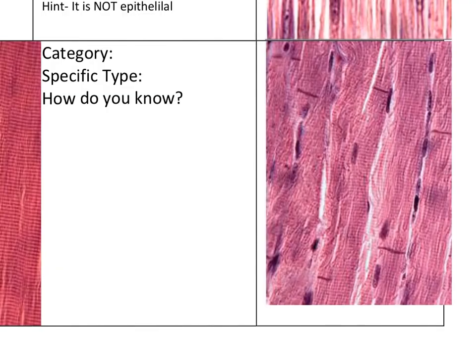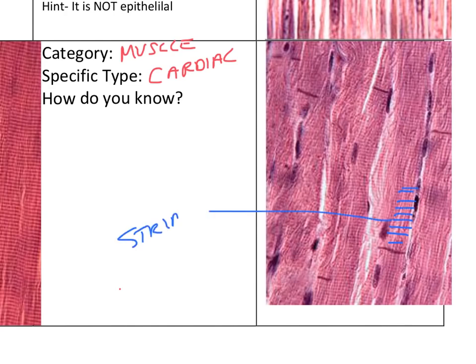And this is one other type of muscle. You're probably taking a stab at this being cardiac muscle on account of the fact that it's the only one we haven't looked at yet, and that would be true. Cardiac. The giveaway is the fact that we have striations. It's striated like skeletal muscle is striated, so is cardiac.